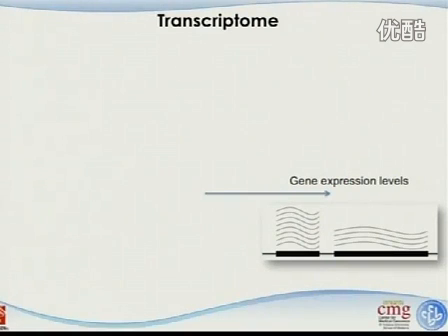The signals are hugely different, you can see that, because they have to hybridize. The design of the probes affects the sensitivity. RNA sequencing has mappability issues and some other issues as well, right? But the point is that they are in the same market. They are solving the same level of biological problem, which is gene expression levels, okay?